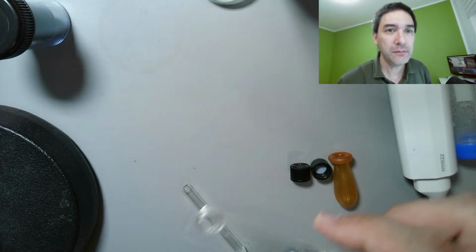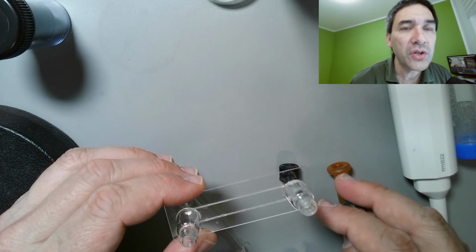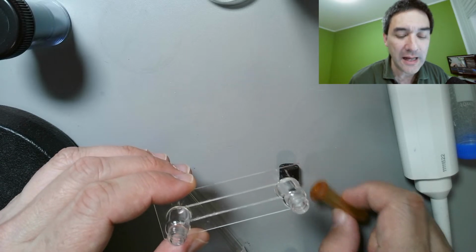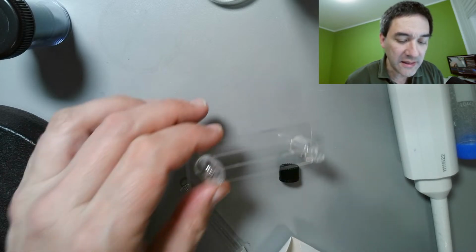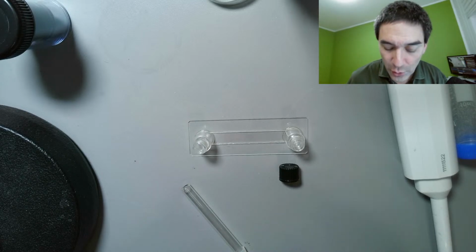So, okay, I'll have another look here. Why or how does it work on the agar that the cultures have colors? For example, total count is red on the test we use in our lab. Okay. So, your question can be interpreted in different ways. I don't know which color you are referring to.